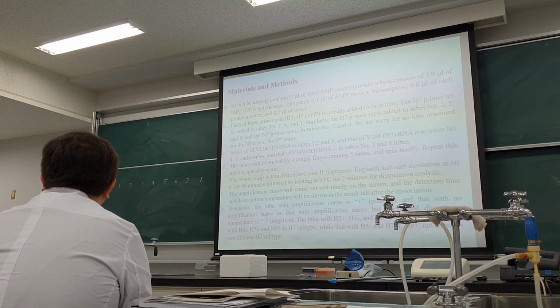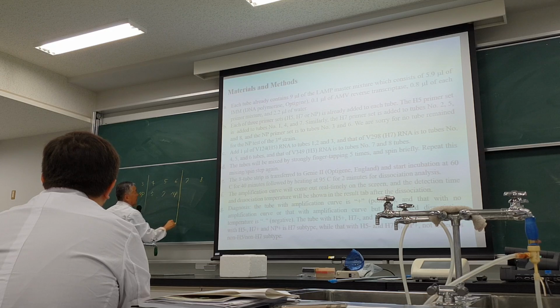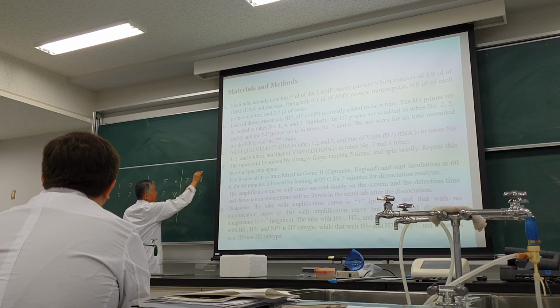Our detection system is H5, H7, NP. H5, H7, NP. There is no spare well, H5 and H7 only.